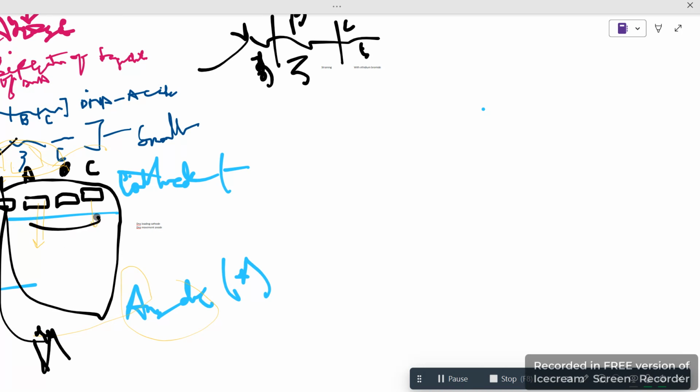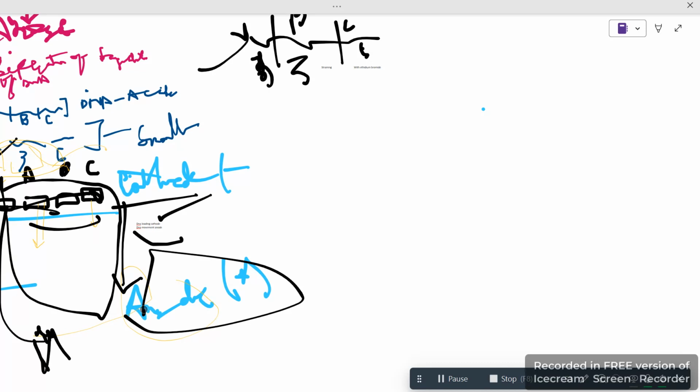Whereas these three simply means cathode. Here certain DNA load from cathode. Here you will see the loading, the movement. Whereas in the downward DNA movement through anode, DNA will move through anode. Okay. So DNA will move from anode, and load from cathode was so far done. And yes, now we're discussing the box where we just saw the undigested particle.